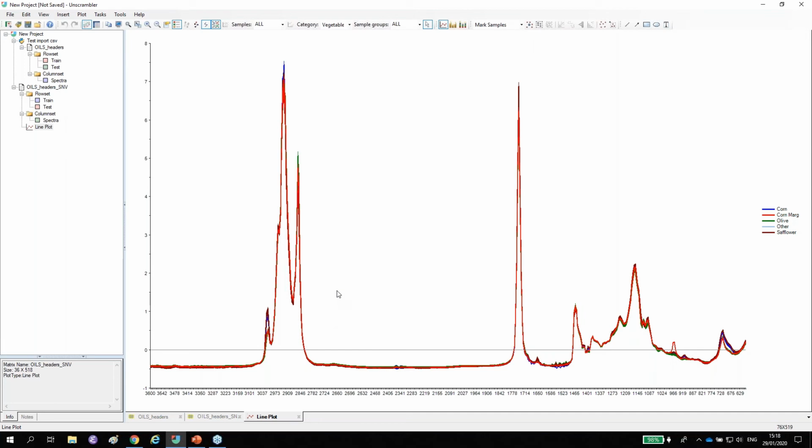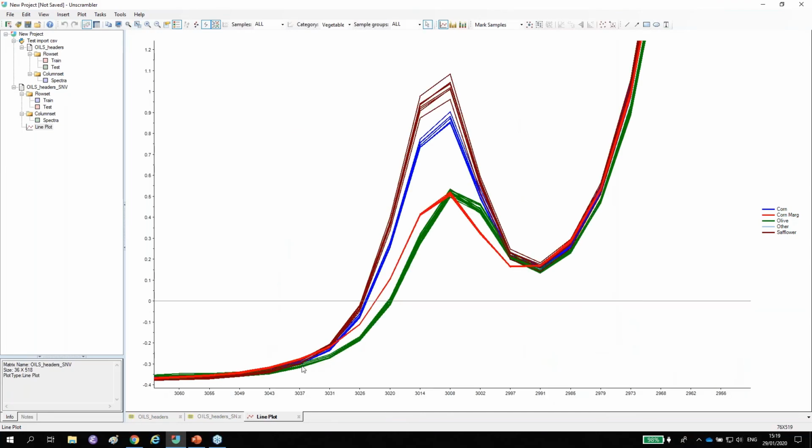And this is when the domain knowledge comes into play, because if these are your data, you will definitely know what these different peaks are, right? So these are actually FTIR measurements of different vegetable oils. And then you can go to this region here, because we want to zoom in here, and to this peak around 3014.